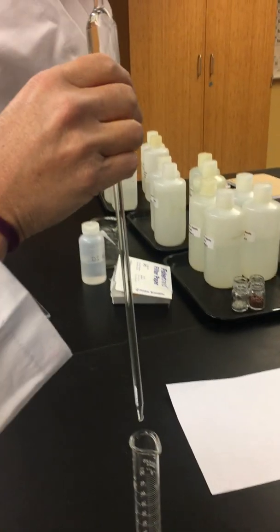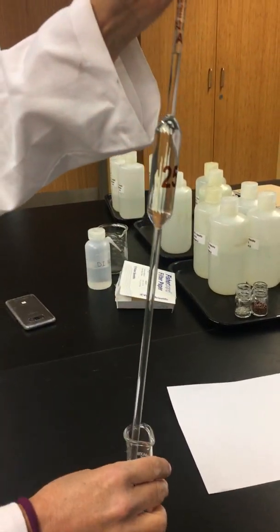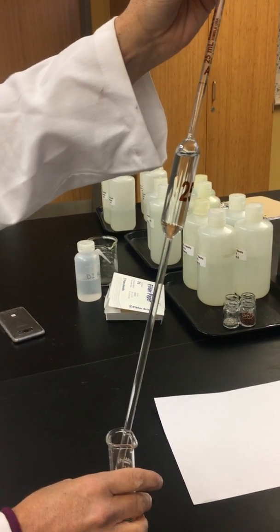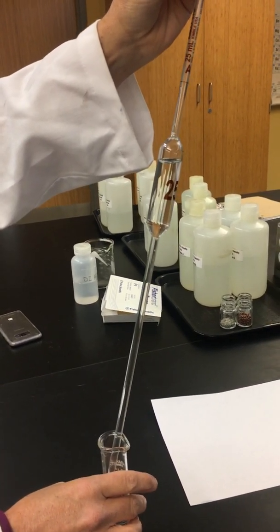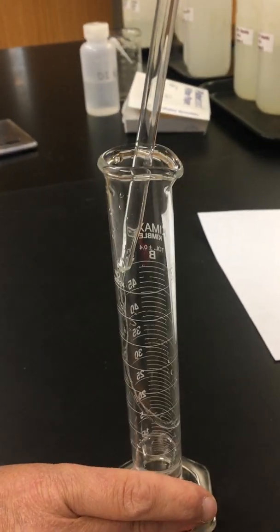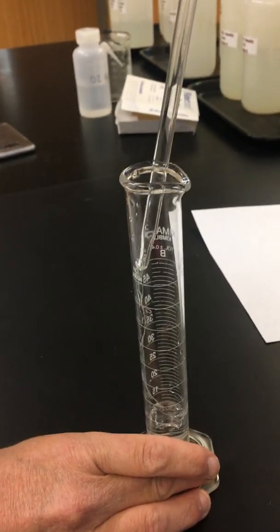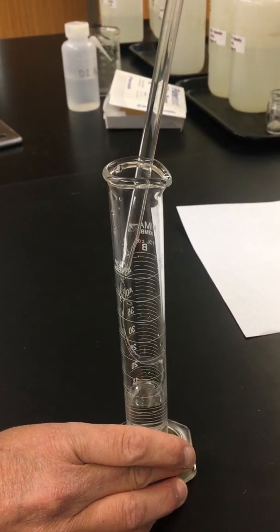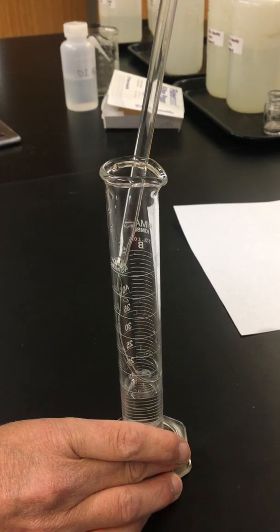So now we'll take our volume and pour it into the graduated cylinder. When we're ready to dispense our volume, we just let go of our finger, and we have it going into our graduated cylinder. Notice I'm touching the glass surface against the glass surface because it helps with the water to pull it through. We're slowly letting it drain out.